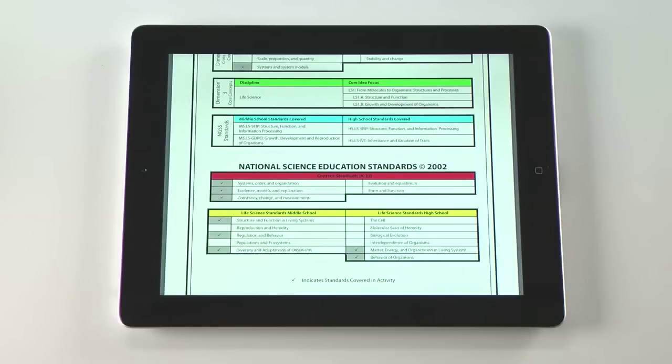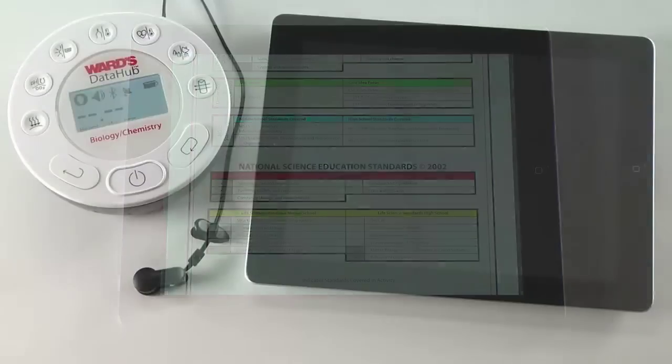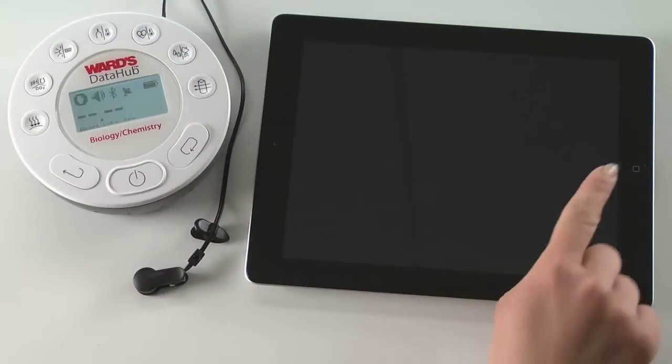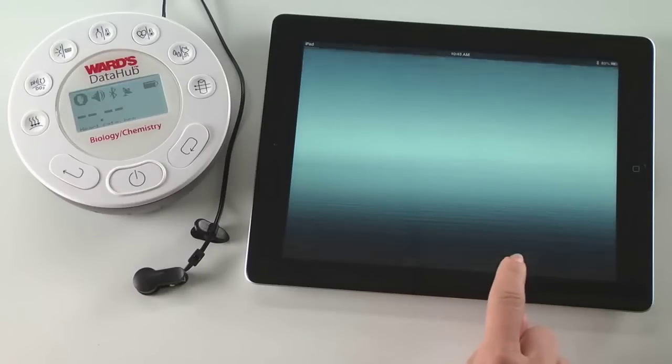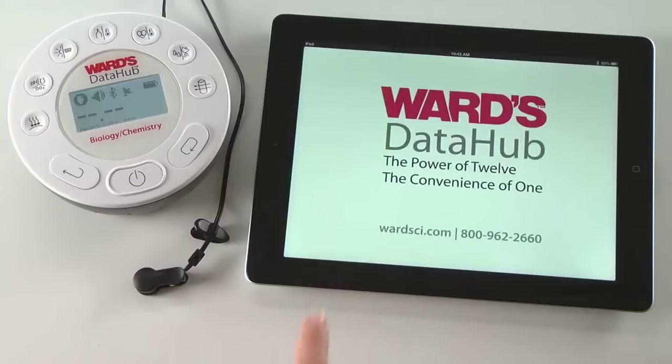We will use the Ward's DataHub software to view real-time data and measure heart rate as a student does exercise in the lab. In just three simple steps, we're ready to begin collecting data.